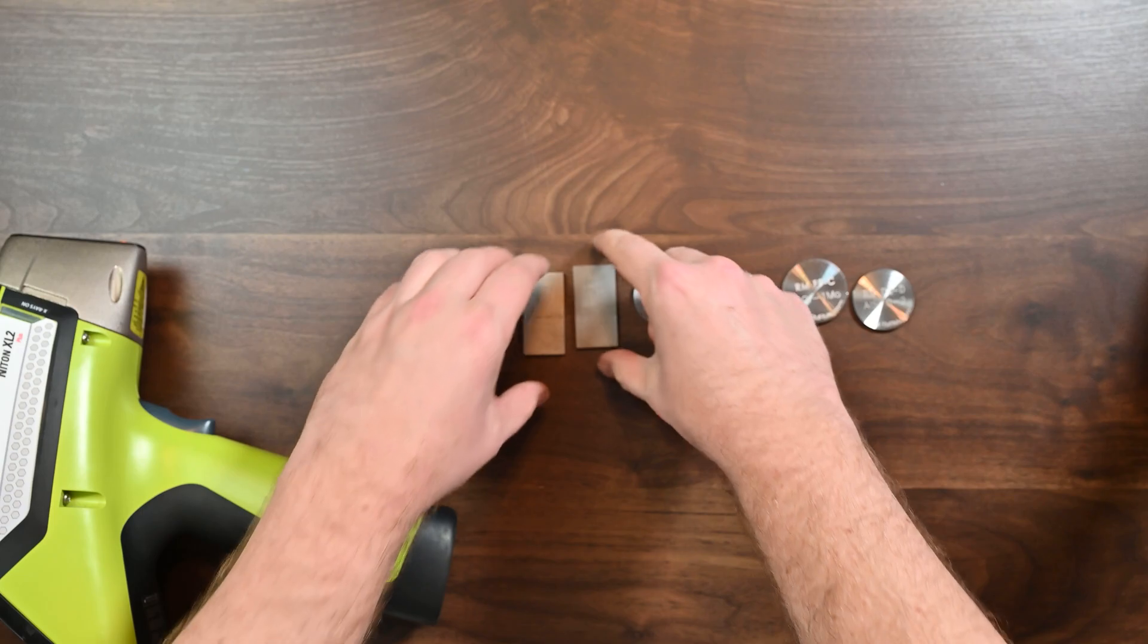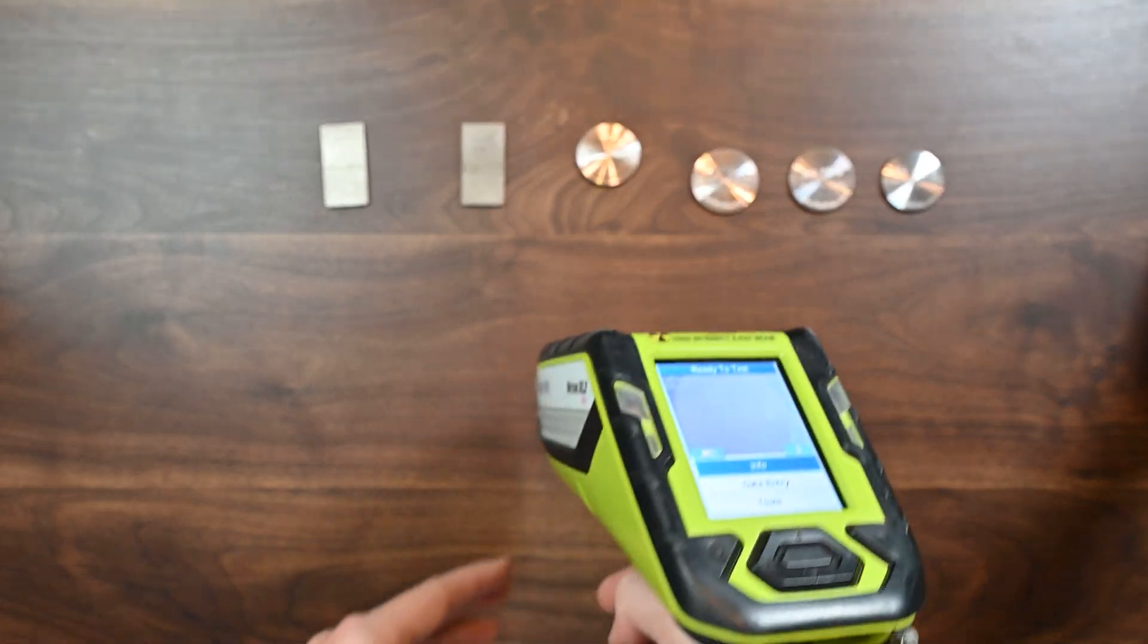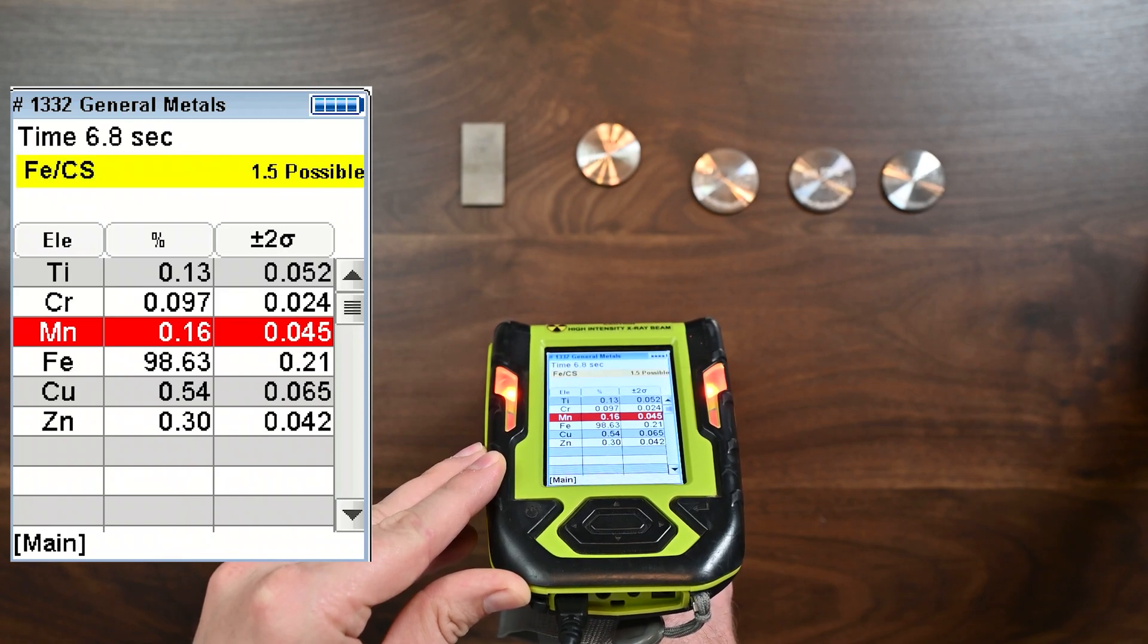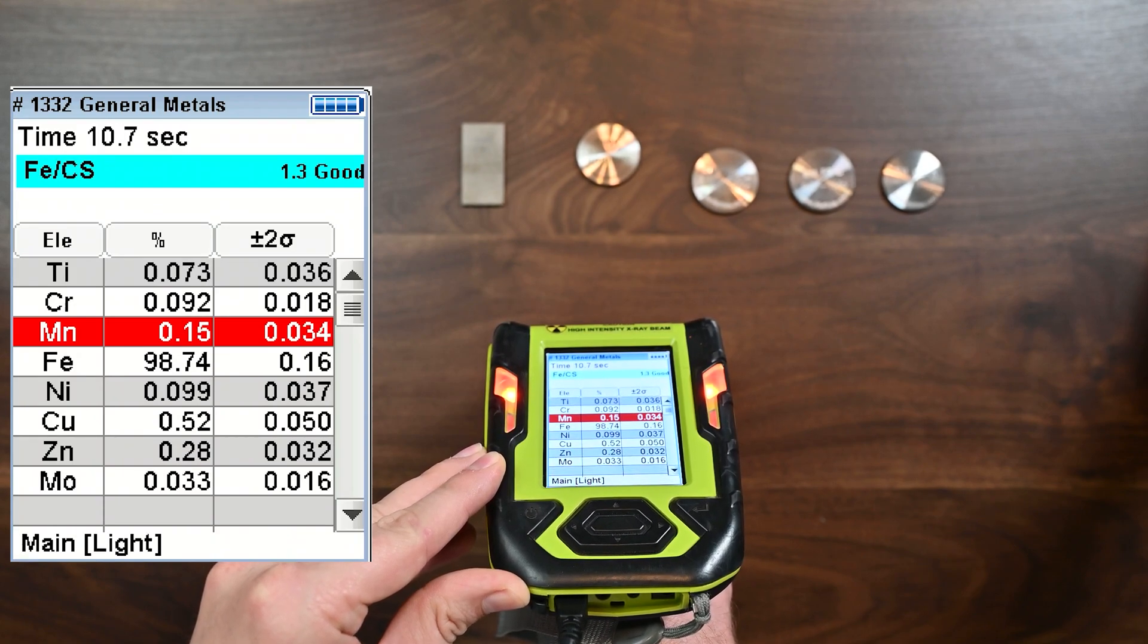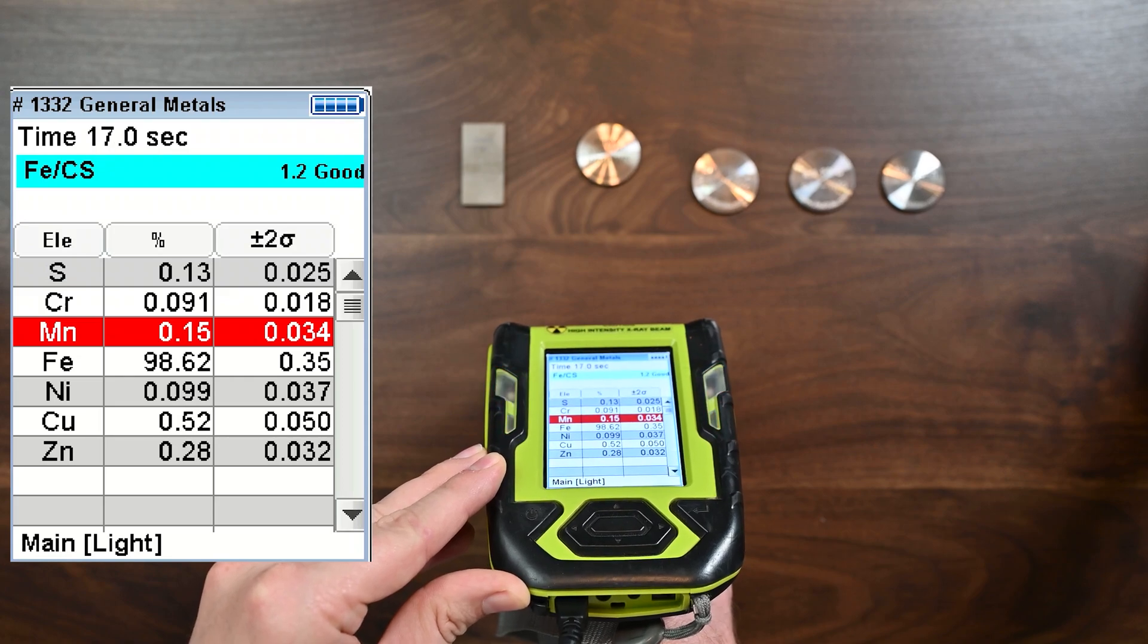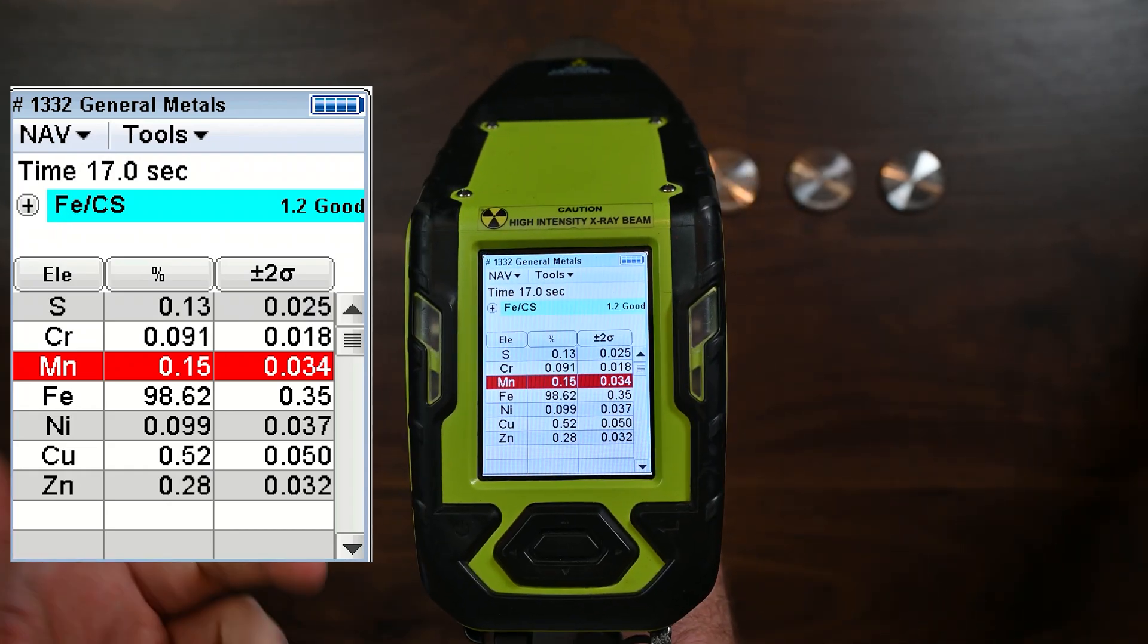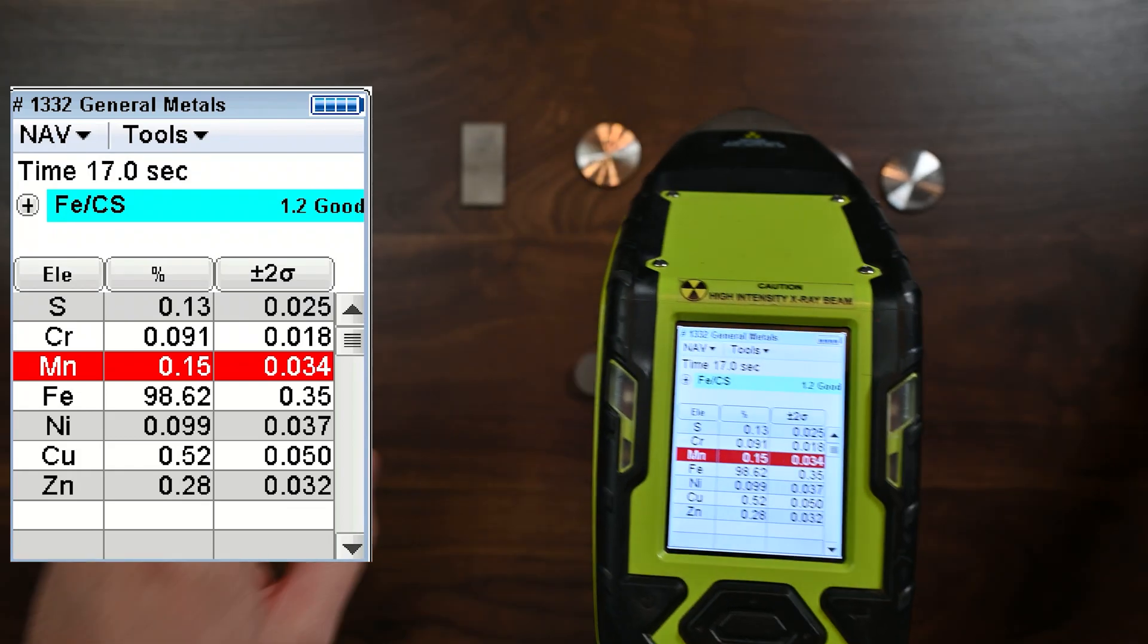So the first thing I'm going to take a look at here, let me just set some of these up here out of the way. We're going to take a look at this steel sample. I'm going to just try to target this right in the middle. We're going to take a good analysis time here, just long enough to get the light elements engaged. What we're looking for is if there's any silicon present here and we need the light element beam to make that determination. So if you are looking for light elements, remember, you've got to wait till that light element beam engages. And it just takes a couple of seconds to do that. Let's see what we got here. You can see it on my screen here. We didn't really pick up any silicon, at least we're probably not looking for it, but we have a really nice chemistry here. You'll be able to see that copper level, that high copper I was telling you about in this alloy.